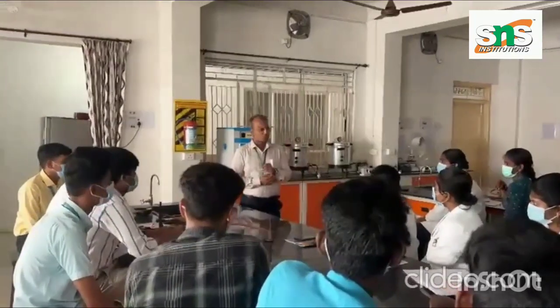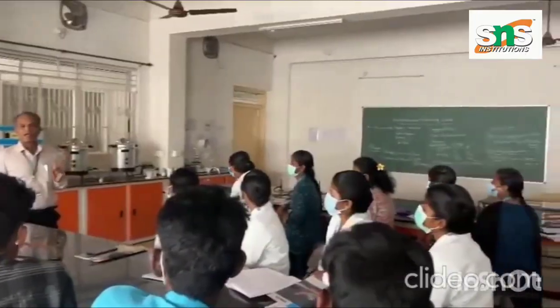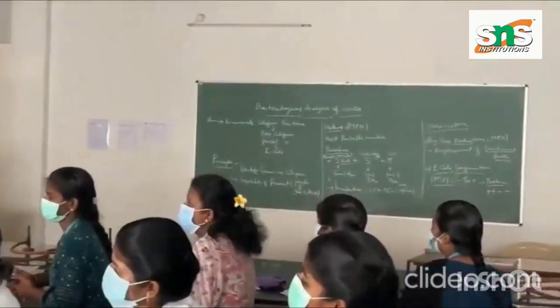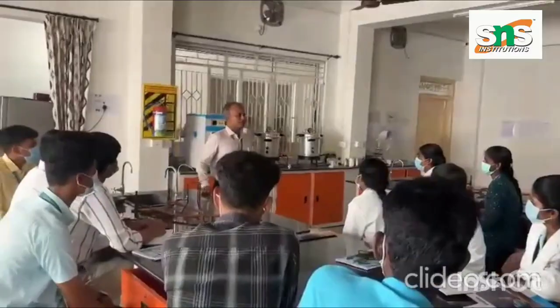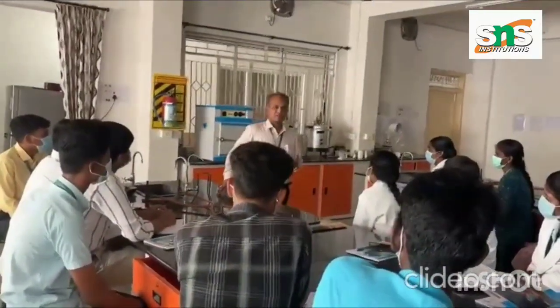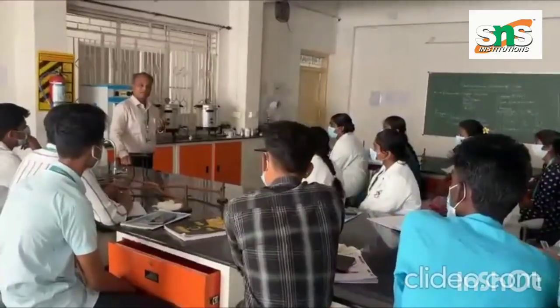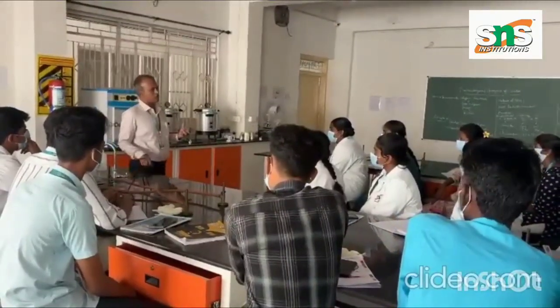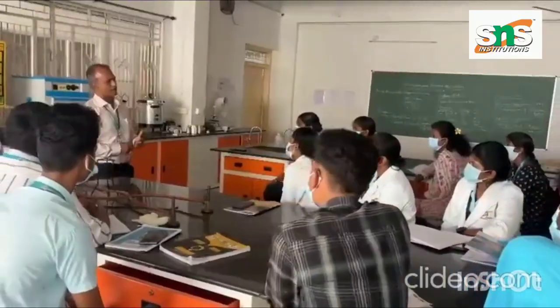Good morning. Today our discussion topic is the bacteriological analysis of water. Why do we need to do bacteriological analysis of water? Is there any importance, especially why we have to perform bacteriological or biological analysis of water? Both are the same thing. Why do we need to perform this practical?